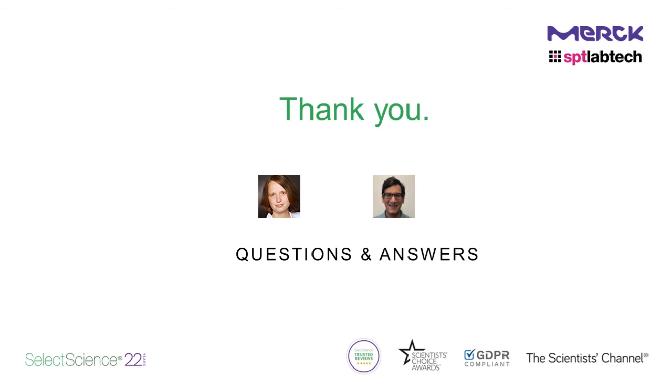Okay, so the first question we've got is, what is the time saving in hours if traditional assay development is compared to assay development assisted by the Dragonfly Discovery?